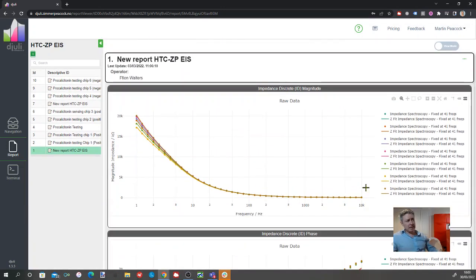So what I want to say in this video is this: if you're an academic or collaborator with Zimmer and Peacock, then we would ask you through this video to create a Djuli account, because it will allow you to upload data and share data with us. If you're a biosensor or screen printed electrode client of Zimmer and Peacock and you need us to look at your data to help with some troubleshooting, we'll also ask you to create a Djuli account and upload your data.